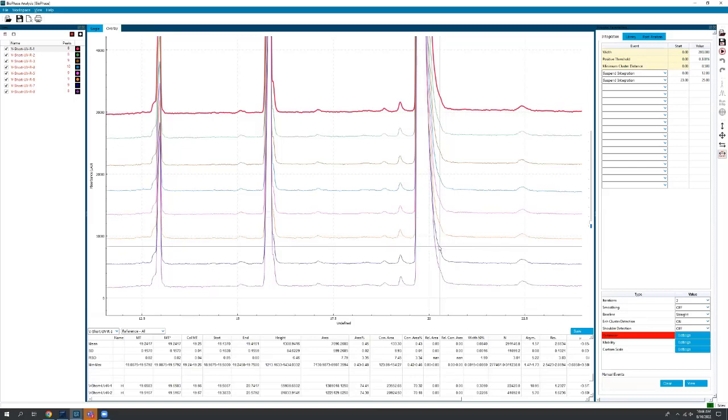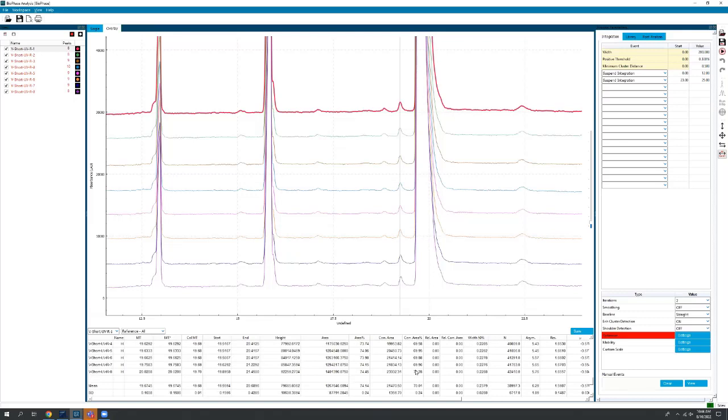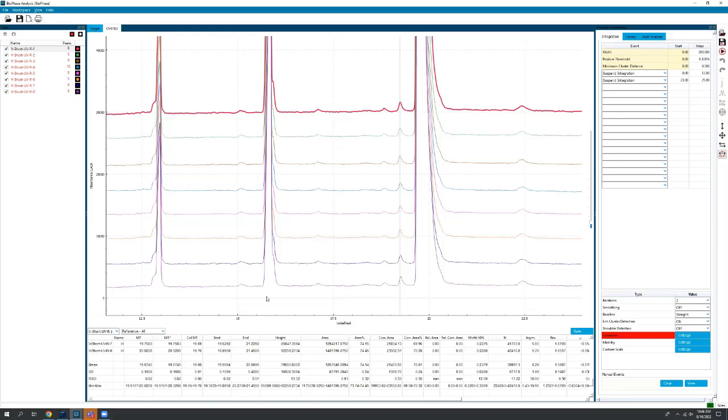Because we didn't merge the back shoulder peaks for all of them. We only did it for a couple. Actually, that was a non-glycosylated. Excuse me, I misspoke there. But when we look at our heavy chain, we have the same thing, right? So we have very reproducible migration times, very reproducible peak areas with our lightning method, and it's getting that result much faster than you would otherwise. So again, we're talking about less than 5 minutes per sample for this reduced analysis.